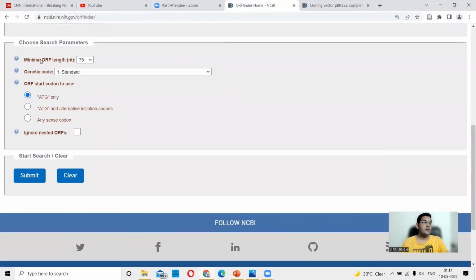Then the threshold length for the minimum ORF length has to be defined. And if you look here, you have options of 30, 75, 150, 300, and 600. So 30 would be too short. We could go by default for now, and then of course you can come back and change the options. So here you are. This is your 75.